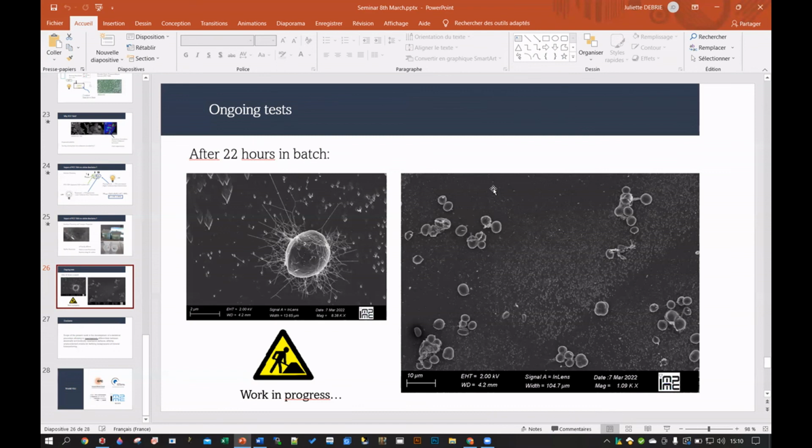So probably this should be on the list for the next experiment: to sample a part of that just before all the protocol for drying. Yeah, but still, with that idea, if you take them from the suspension, maybe we will be able to see the inclusions, at least without going through critical point drying. This is why I realized that they look empty, but then you would expect that they lose their inclusions when you go through that procedure.